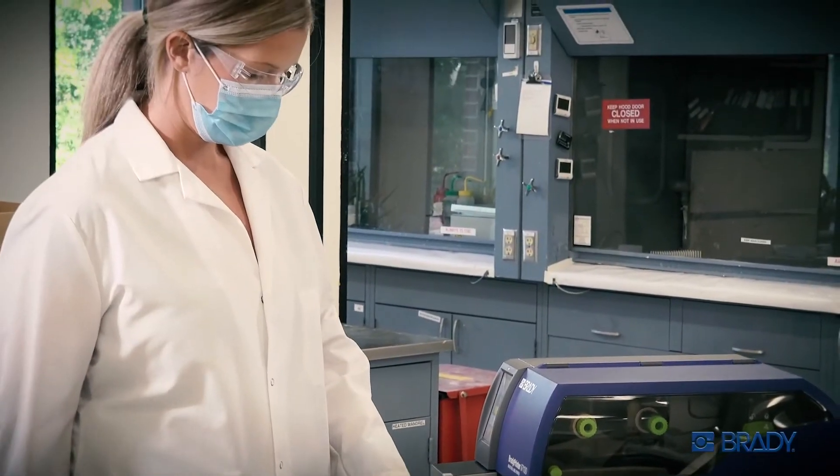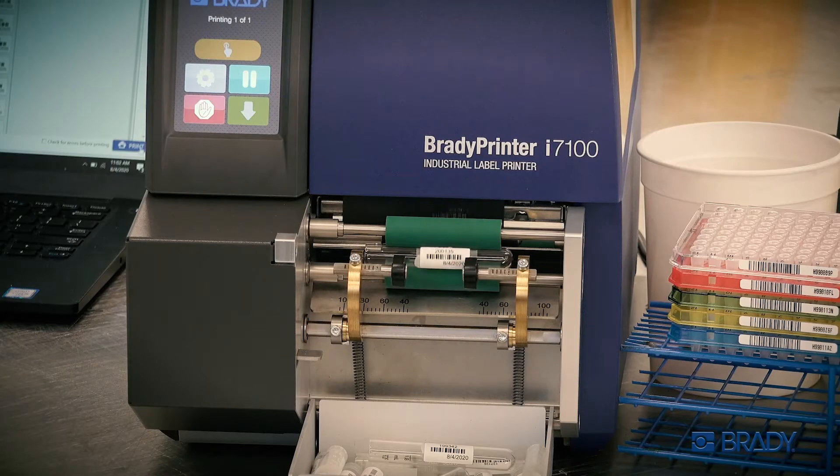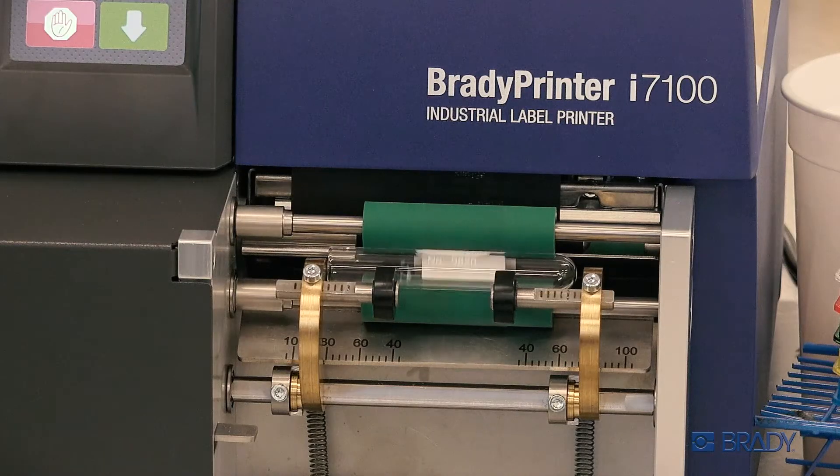The Vial Label Applicator conveniently pairs with the printer to give you automated print-and-apply productivity that kicks your workflow into high gear.